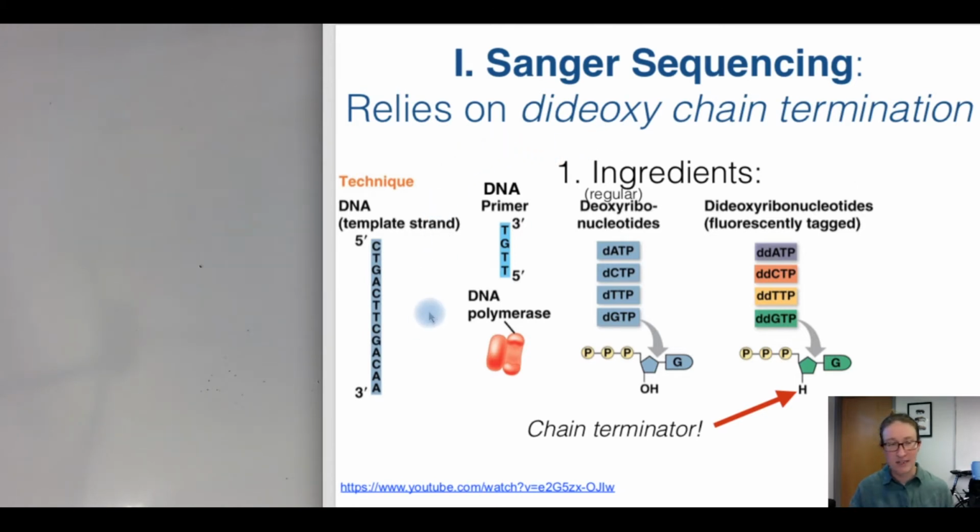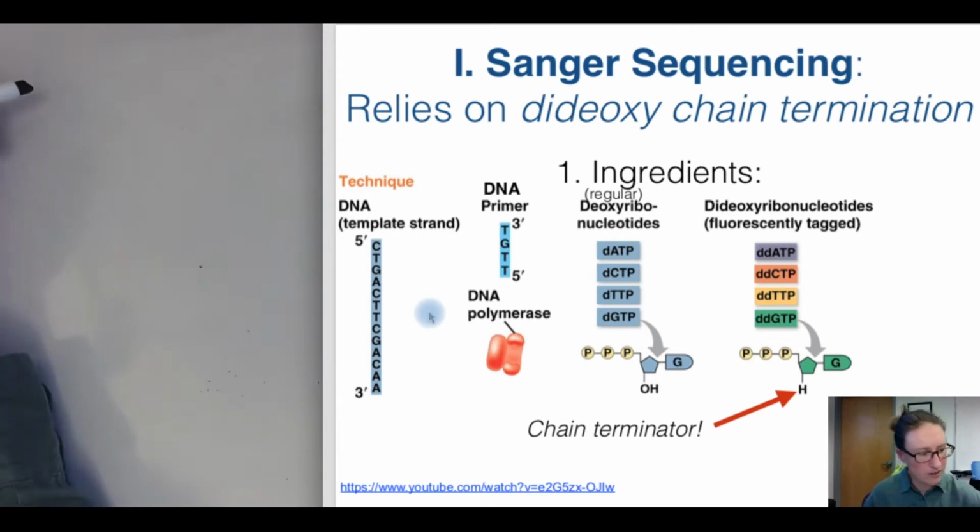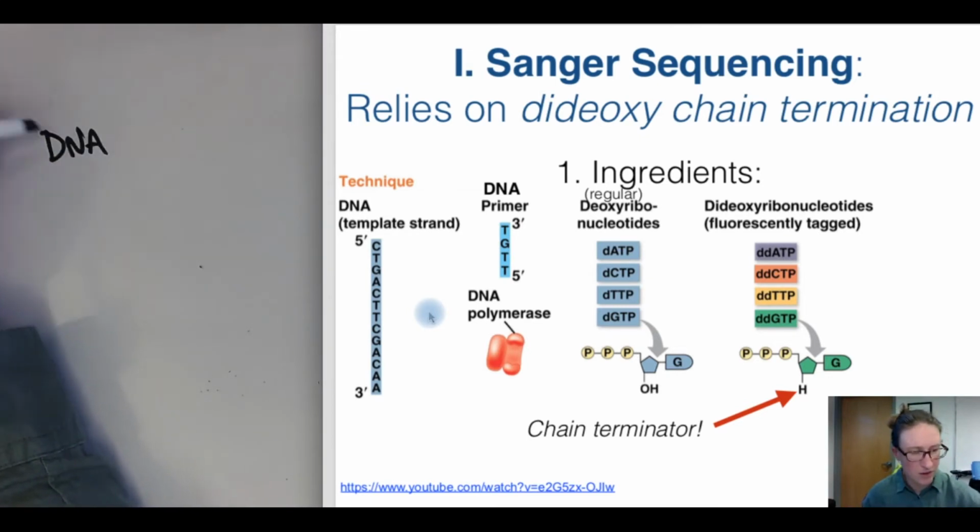So first off, you need DNA, right? Whatever it is that you want to sequence, you need that organism's DNA. Then you also need a DNA primer.